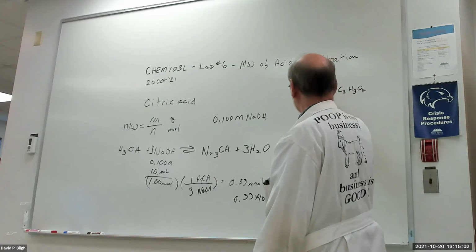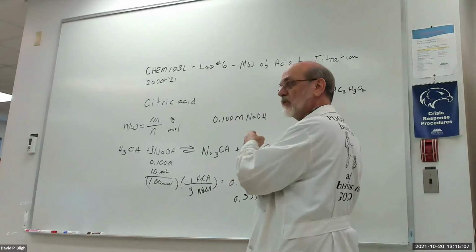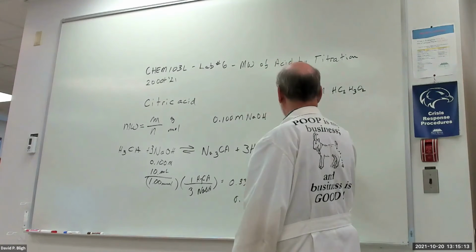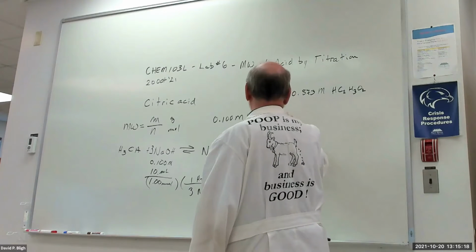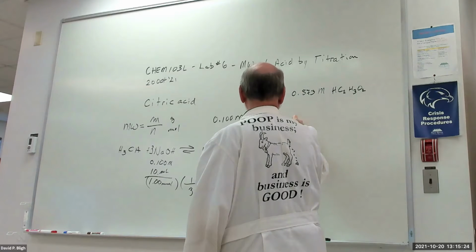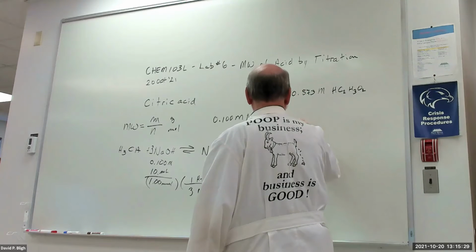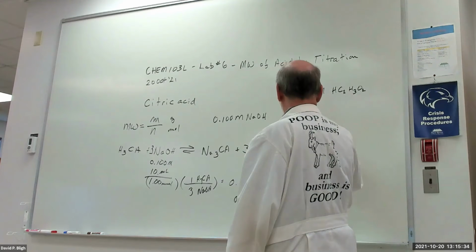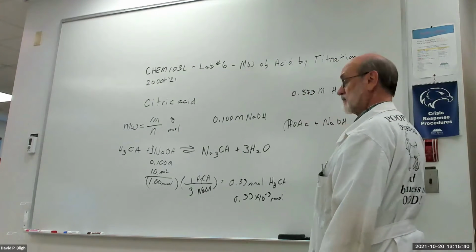So if we know this concentration of acetic acid, then we need the equation for the two, right? One hydrogen here, one hydroxyl. So this one's easy. You just have acetic acid, and I write it this way sometimes. Like that. So there's our acidic hydrogen, and we've got sodium hydroxide, that 1,1, right?